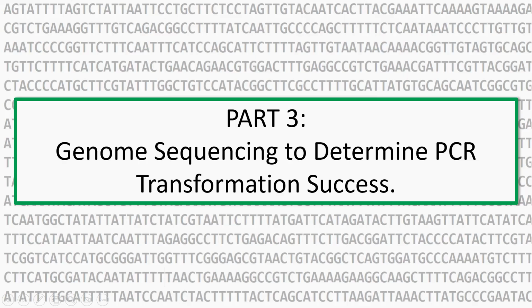This short video follows on from part 2. Here I will show the outcome of the transformation experiment. I will also show the sequencing data for the gene knockout.